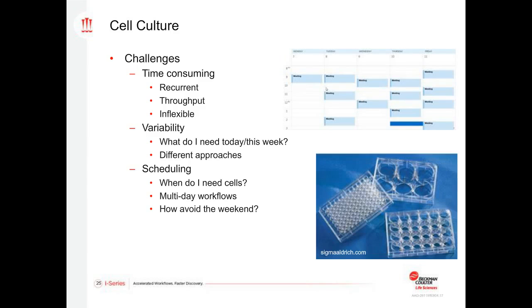In addition, there's high variability in this type of work. For example, sometimes you just have cells that you're waiting to plate later in the week, and so maybe you don't have that much work, but Monday may look very different than Thursday, or this week may look very different than next week.